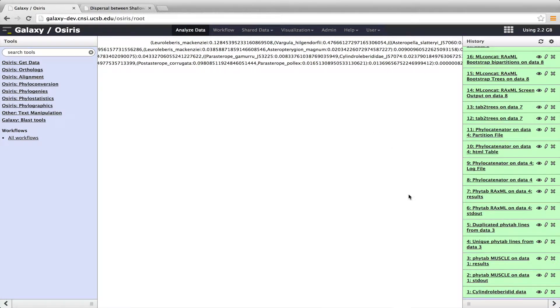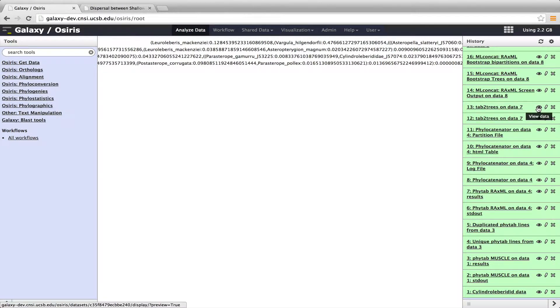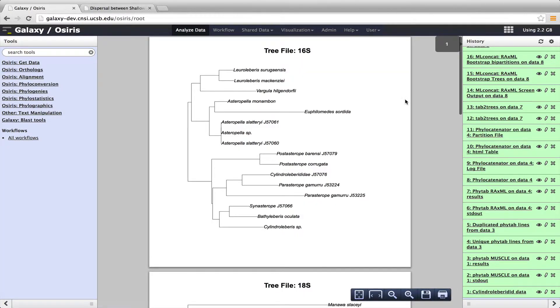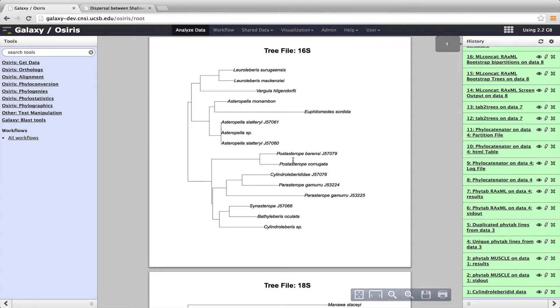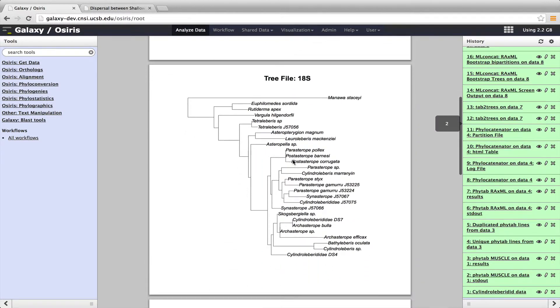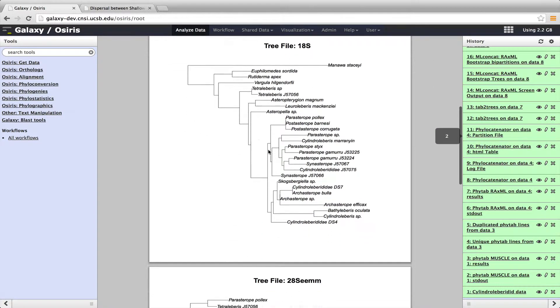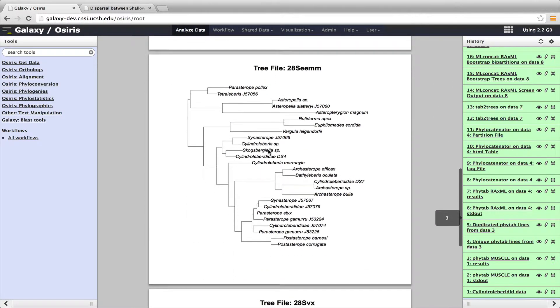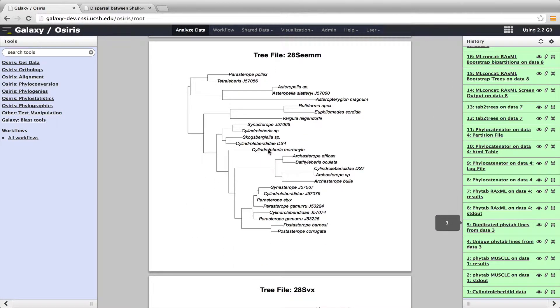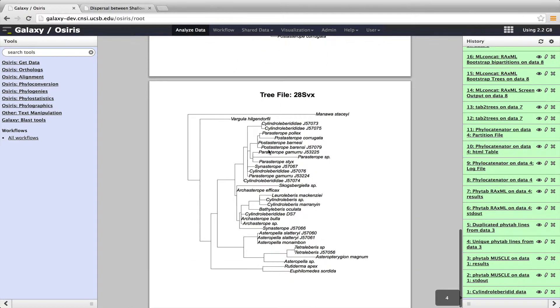And then we can use the output of that, which is the output of Phytab RaxML, and put that into Tab to Trees. So Tab to Trees was where the program makes a PDF book, a book of the different gene trees. So we have the 16S tree shown here. So in this case, if we wanted to examine each gene tree separately, that's what we can do here. So we have 16S, we have our 18S tree, and we have one 28S region, and we have another 28S region.